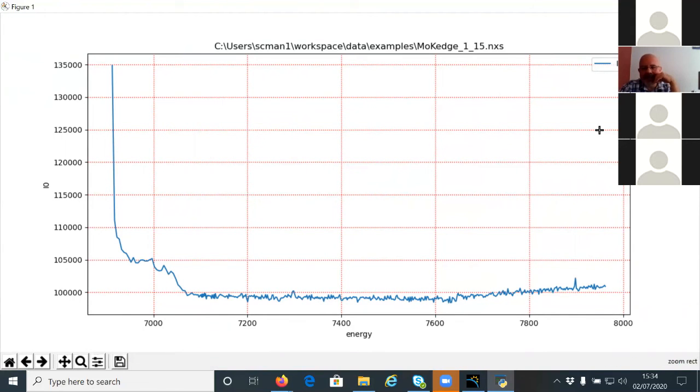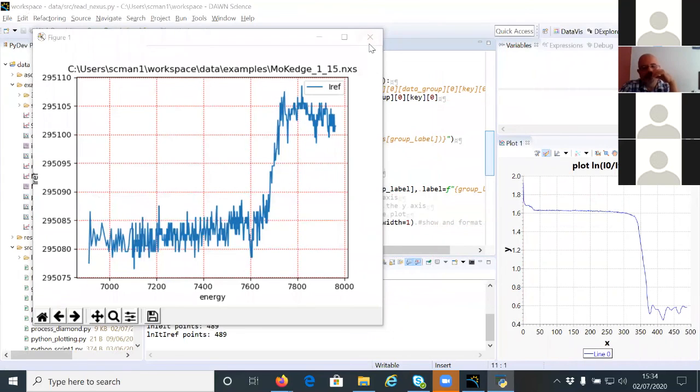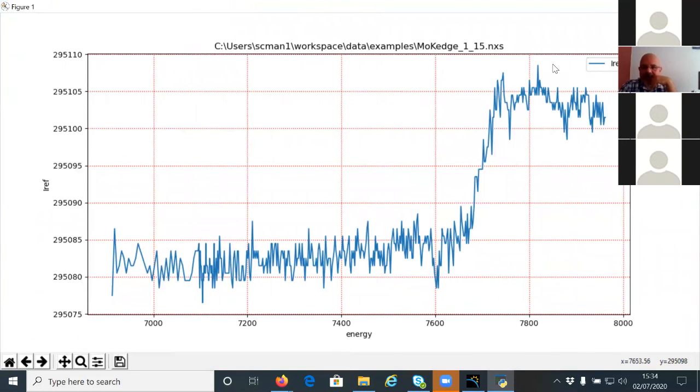Just one small question, Abraham, about the figure itself. If we want to export the figure, how do we do it? Do we export it as an image, or can we export the XY data? For instance, at the moment, the figure, or when we play with the range that we want to show.